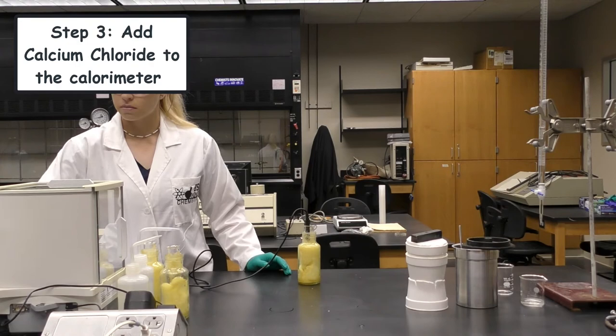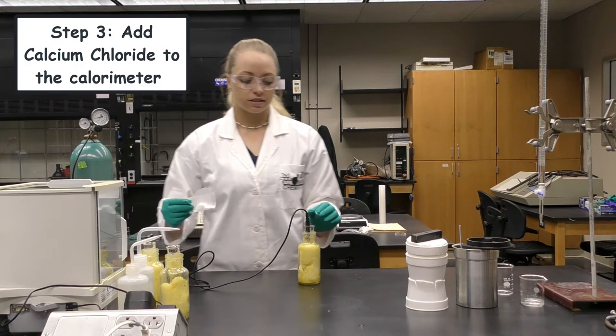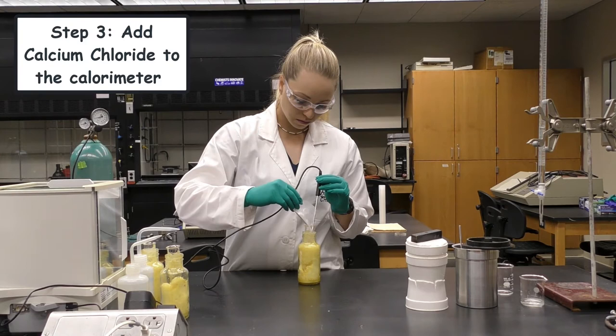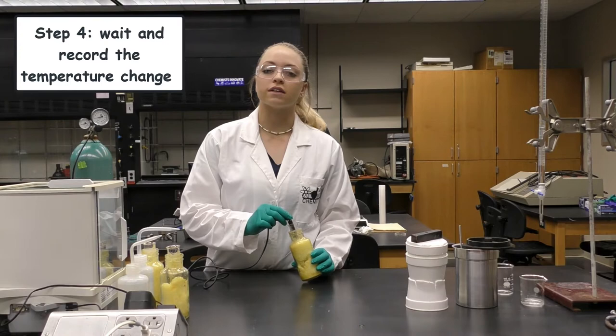Now that we have our initial temperature, we can add our calcium chloride. We will be adding 3 grams of calcium chloride to our calorimeter.